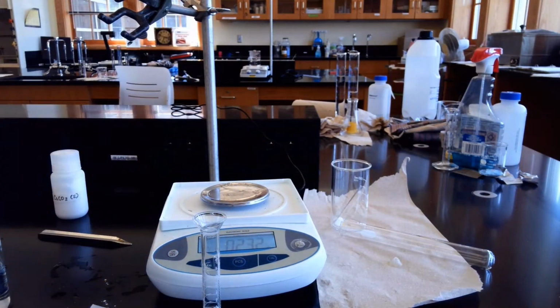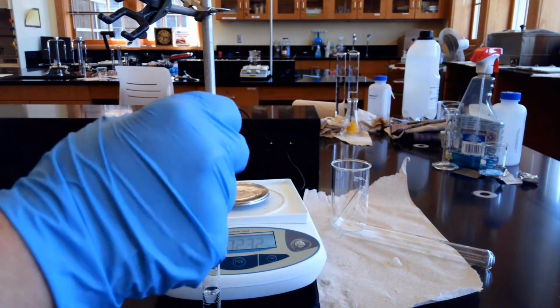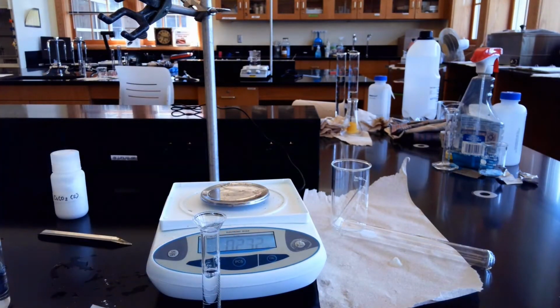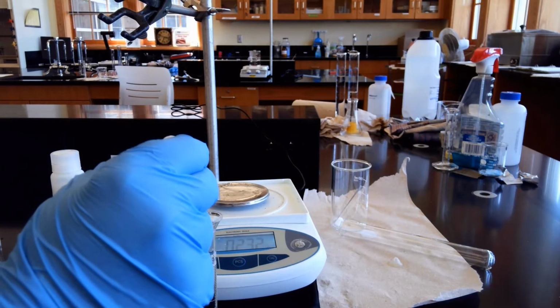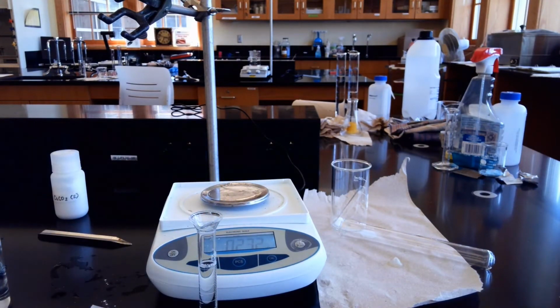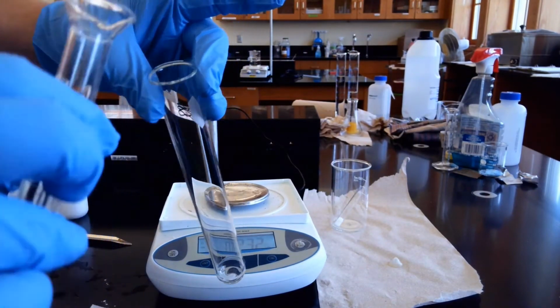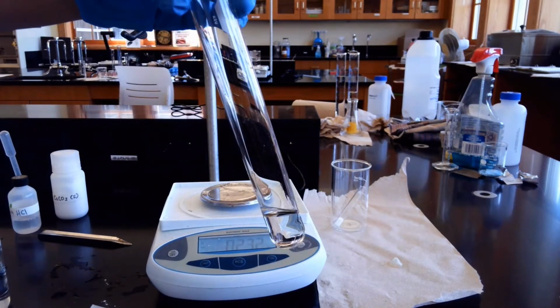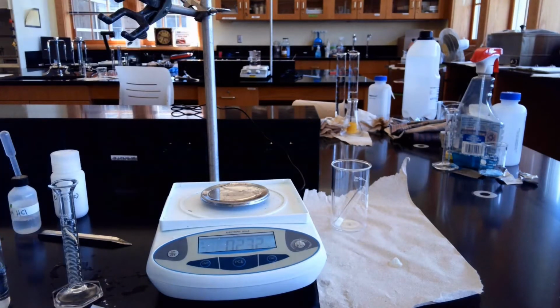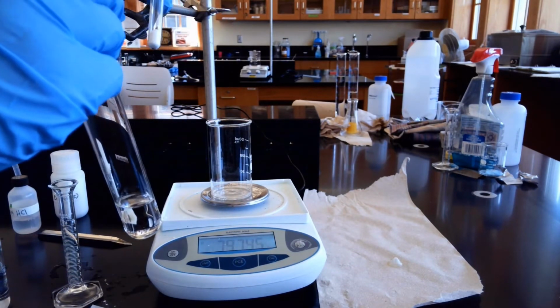And the HCl will react with the CaCO3 to form carbon dioxide. So we are at 10 mils right there. So we're going to take those 10 mils and we're going to pour them straight into our test tube. So we have it all in there now. Here comes the hardest part. We have to take this little tiny test tube and slide it into here without it mixing.